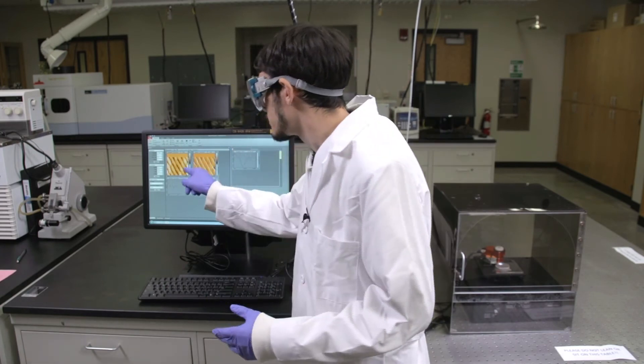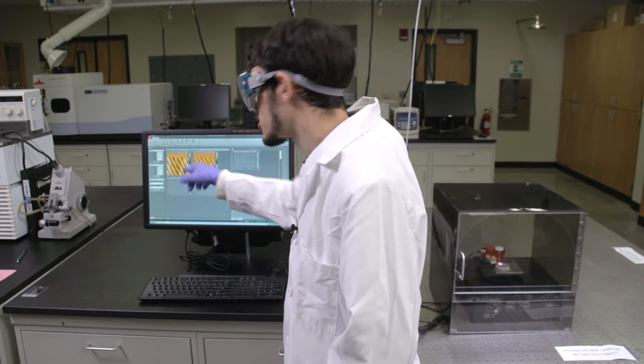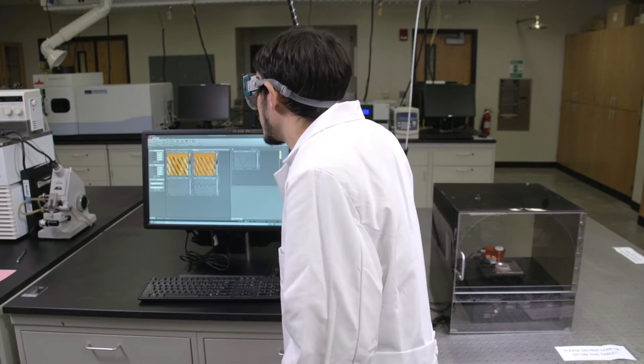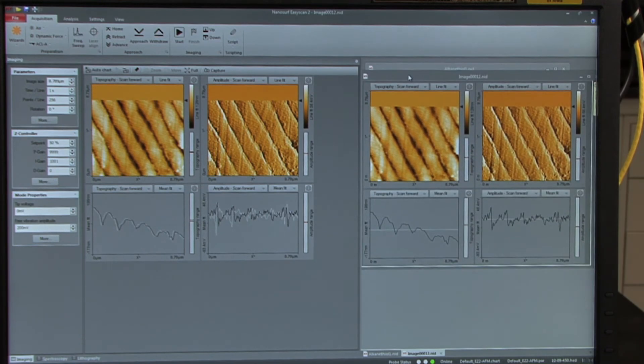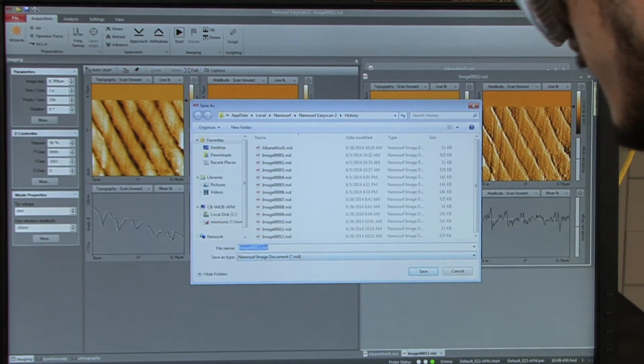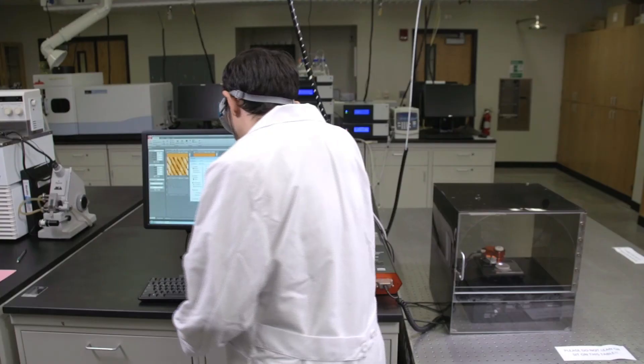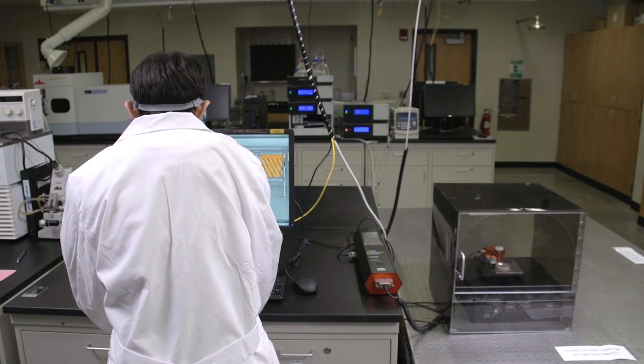Also, you'll want to make sure that you save an image of the actual AFM image itself, and in order to do so, click capture, and an image will pop up as an NID file. You'll want to save this NID file by going to file, save as. And again, appropriately titling the image according to which alkane thiol you've imaged.